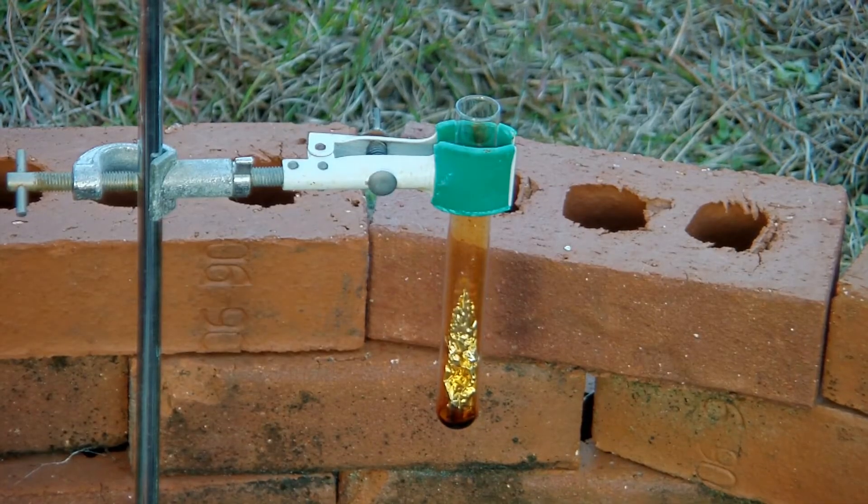This reaction is interesting because there's a bit of an induction period before it happens. That's partially because it's very cold out today, but also because the bromine has to eat through the aluminum oxide layer that's always on the outside of aluminum.